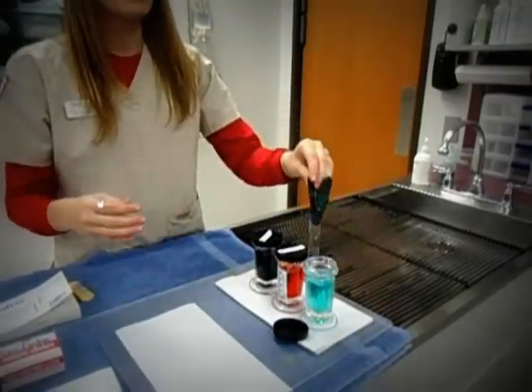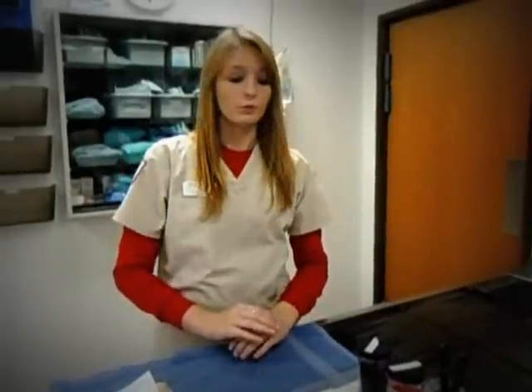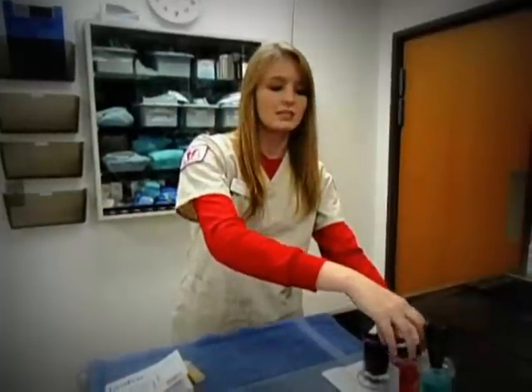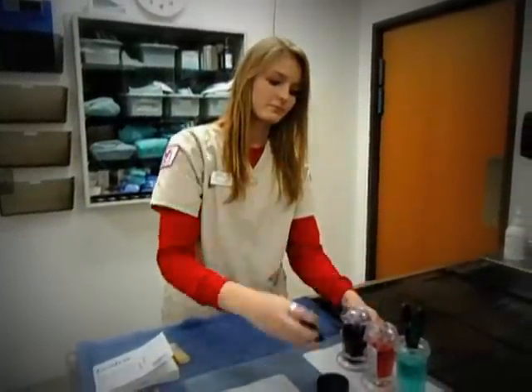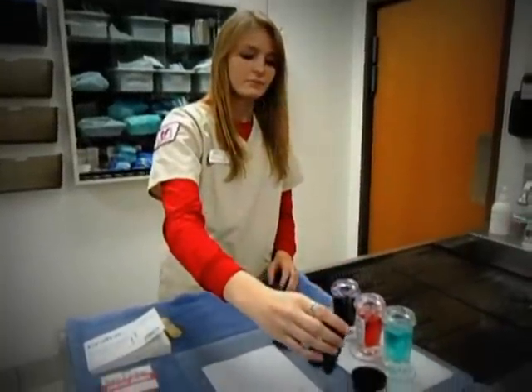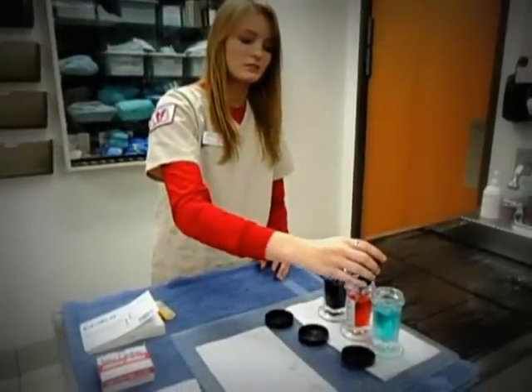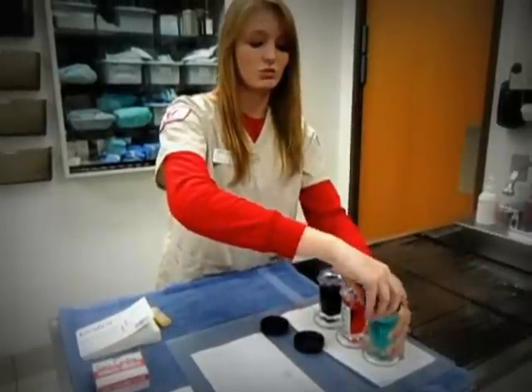I now place my slide into the stains. The first stain acts as a fixative and removes all the moisture from the cells on the slide. We usually like to leave the slide in each stain for about ten seconds apiece. We like to dab along the towel so that we don't take too much of each stain into the other stains.